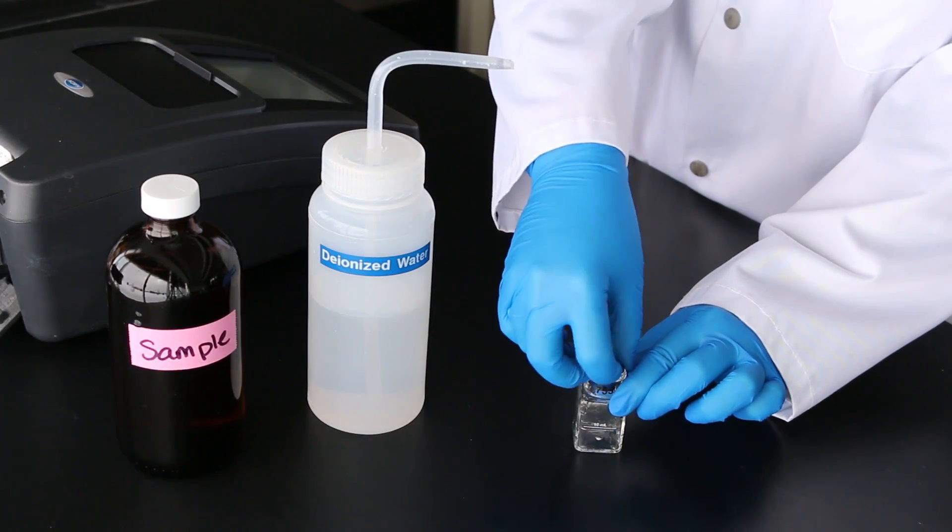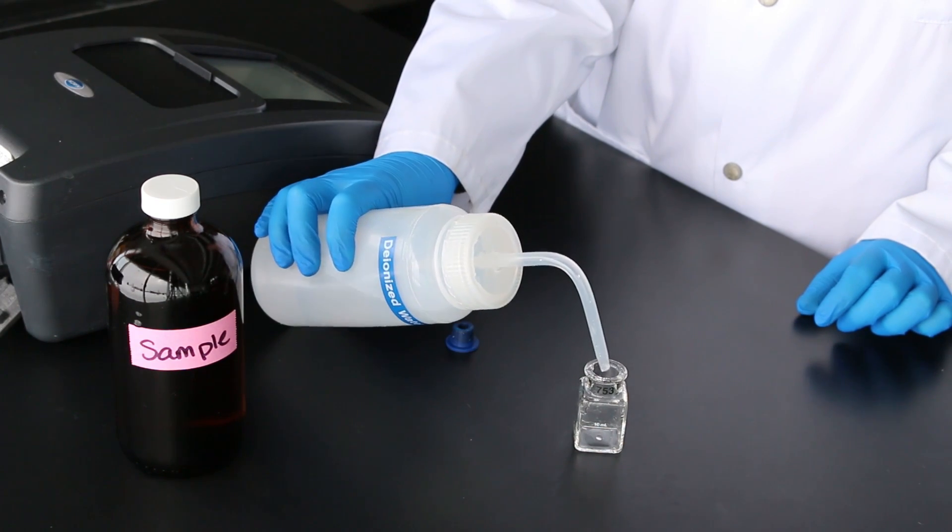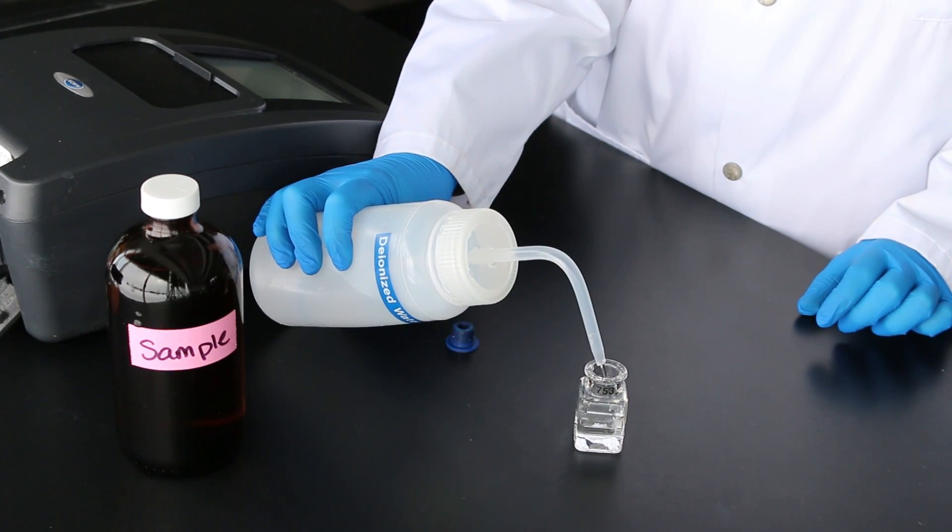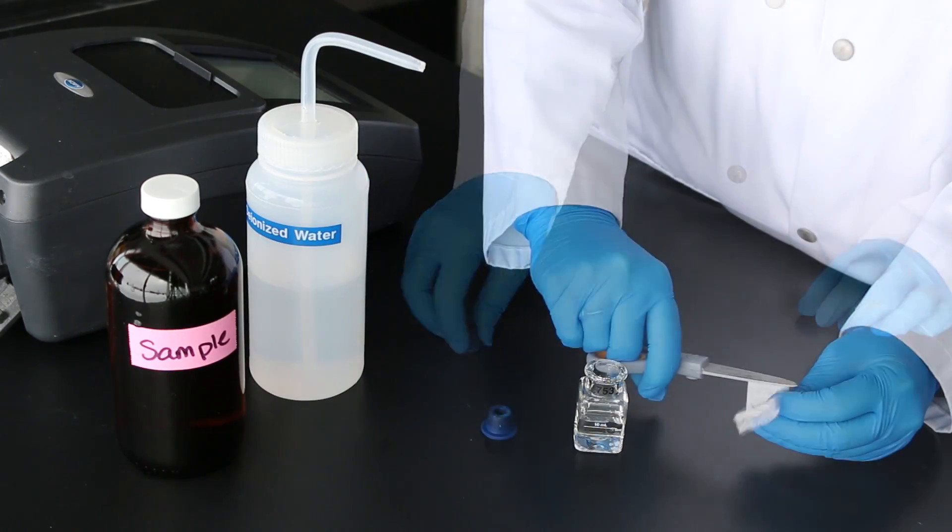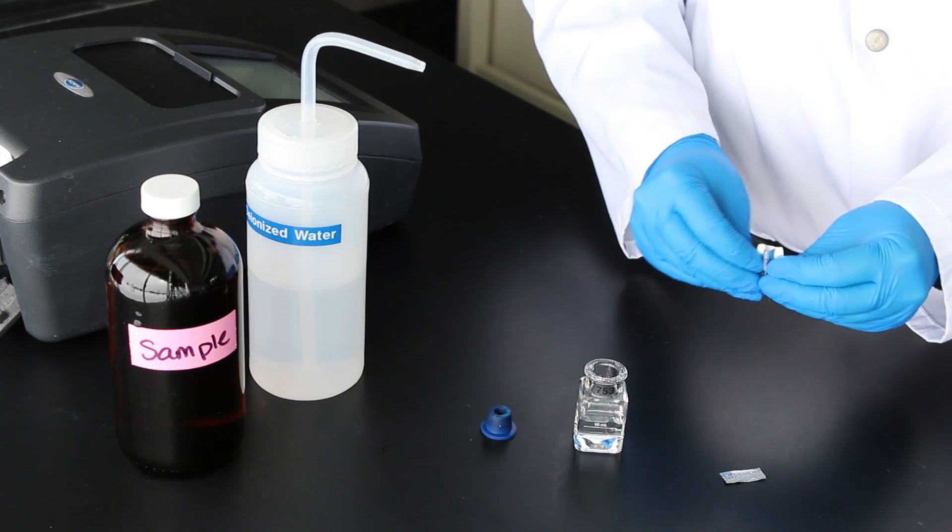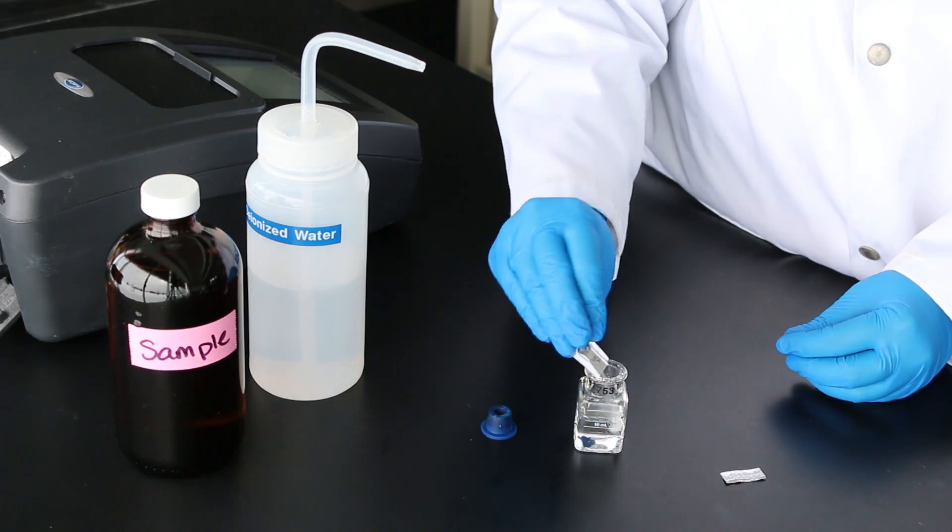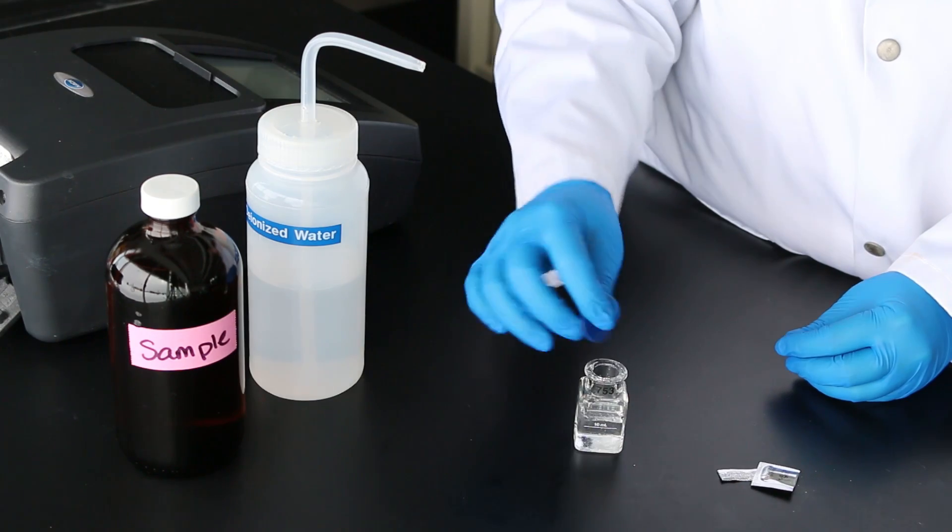As best practice, a reagent blank should be measured for each new lot of reagent. A reagent blank is completed by replacing the sample water with deionized water and following the same method for analysis. If a value is obtained, it can be subtracted from the sample results to minimize the interference caused by the reagent.